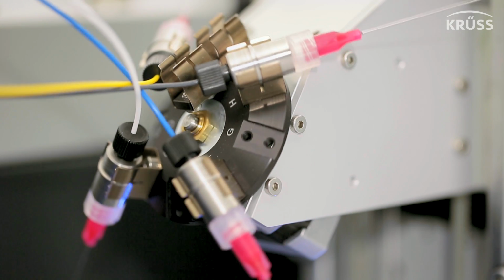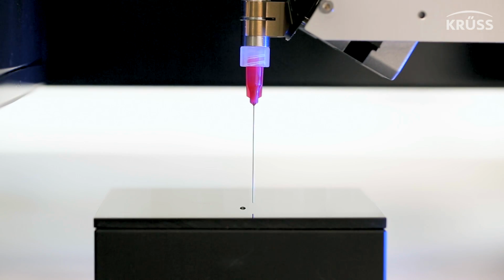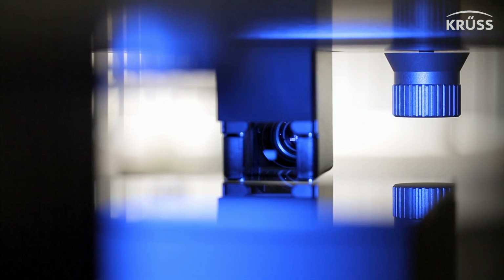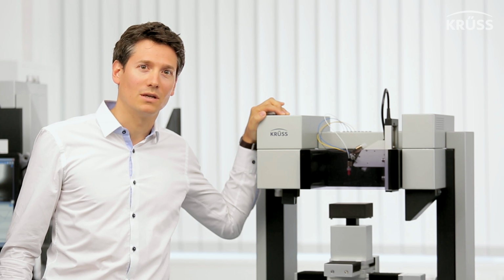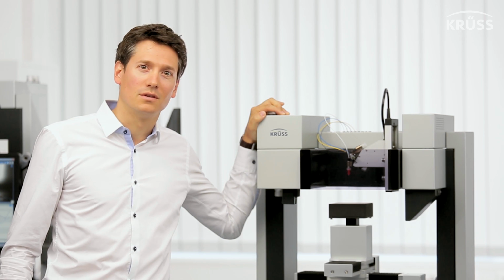To capture the full surface-free energy, two drops with different polarities are analyzed. One highly polar, like water, and the other one highly disperse, like diiodomethane. However, this gold standard in surface-free energy measurement has always been complex and time-consuming, and therefore not a good option for quality control. Until now.